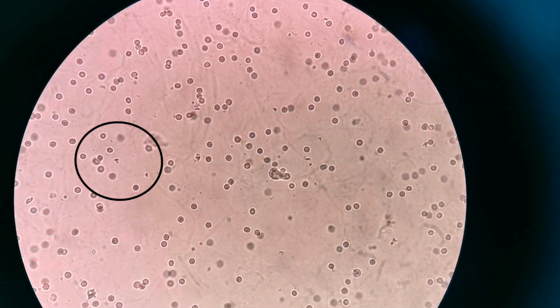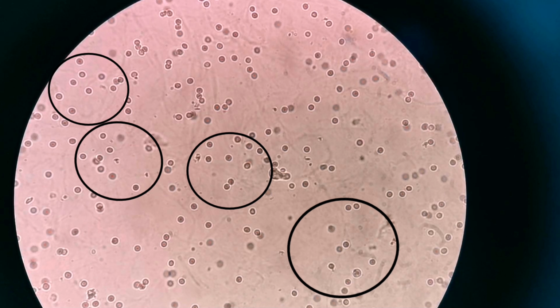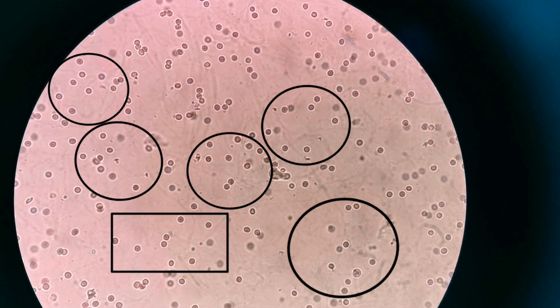1, 2, 3, 4, 5, 6, 7, 8, 9, 10. There are 10 RBCs. Now I will enclose the RBCs by 10. Count with me. 20, 30, 40, 50, 60, 70, 80, 90, 100. I enclosed a total of 100 RBCs.